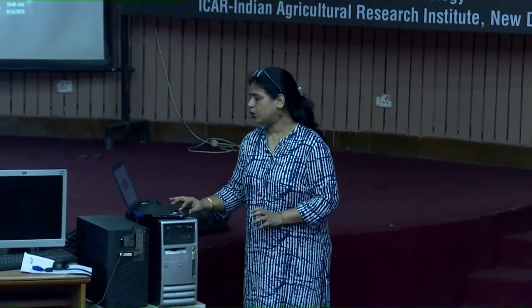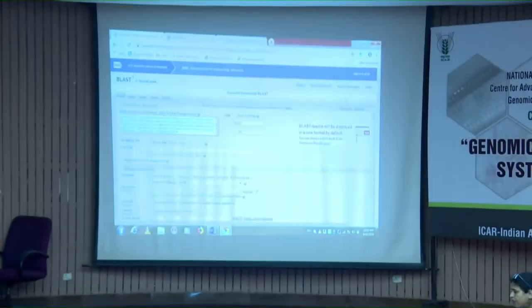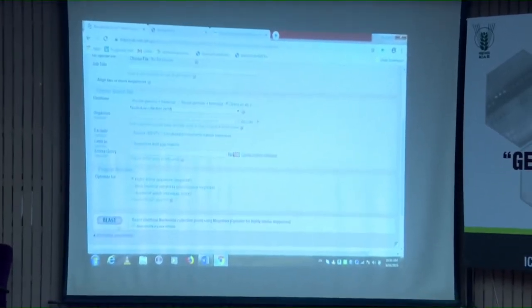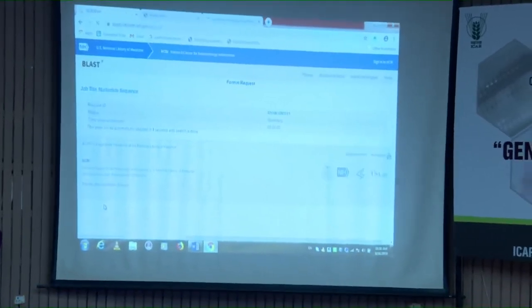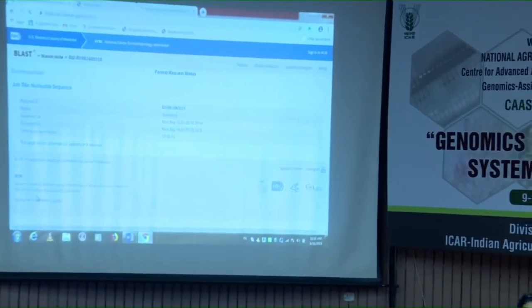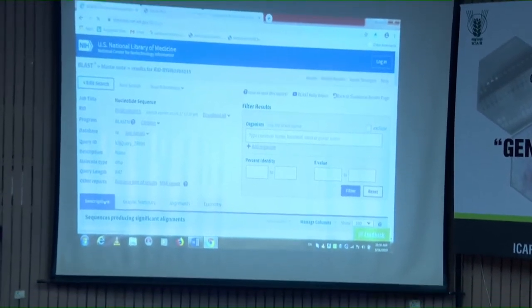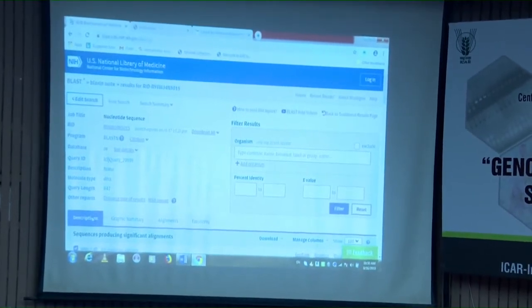So what you can do is download one sequence, then go to NCBI and do a nucleotide BLAST of that particular sequence. Let's suppose I have pasted that sequence in NCBI BLAST. This will give you the hits, the identical sequences for this particular gene. They may be from different isolates, strains or species, but it will show you how identical they are with reference to your other hits.